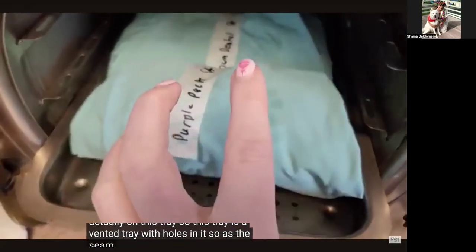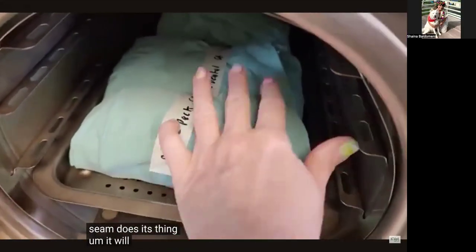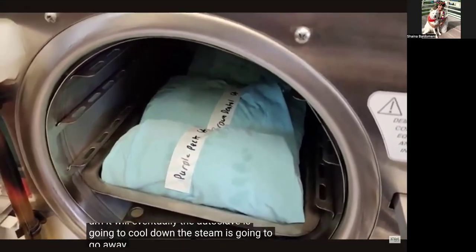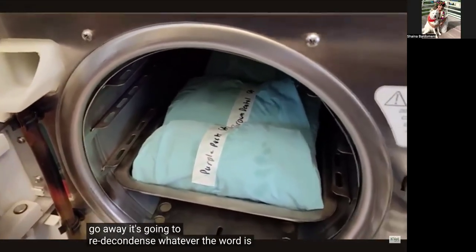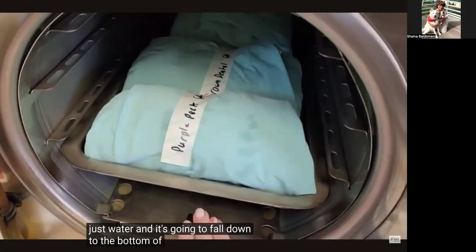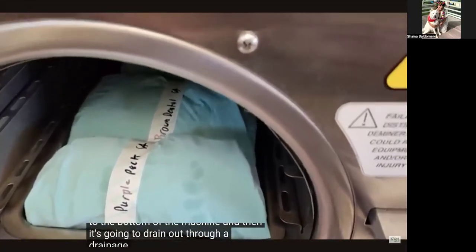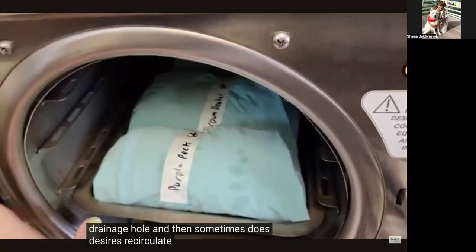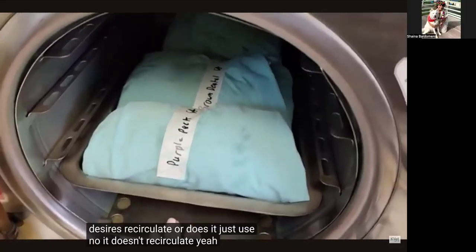So as the steam does its thing, the autoclave is going to cool down, the steam's going to go away, it's going to re-condense, whatever the word is, into just water, and it's going to fall down to the bottom of the machine, and then it's going to drain out through a drainage hole. And then sometimes, does ours recirculate, or does it just use? No, it doesn't recirculate. Yeah.